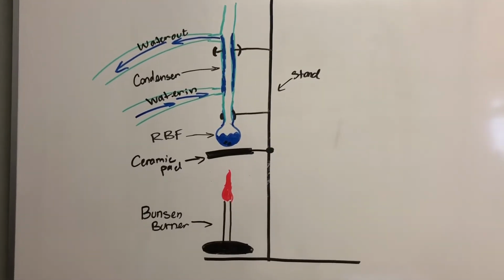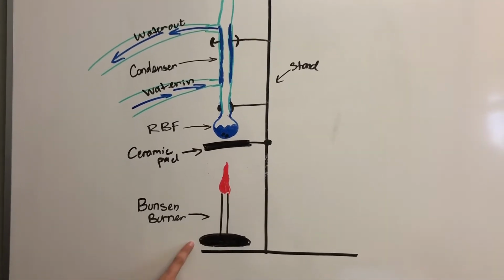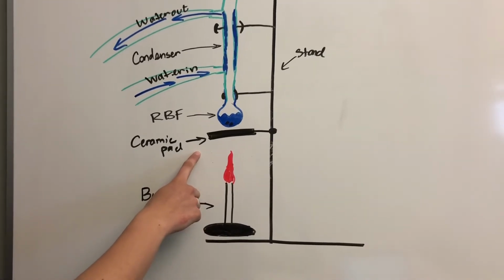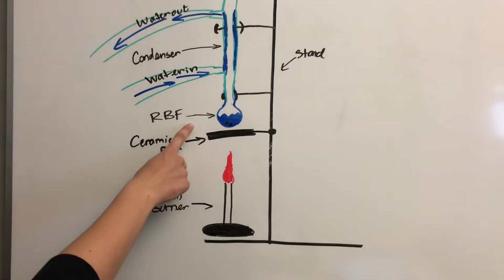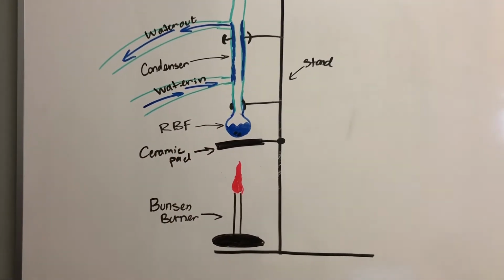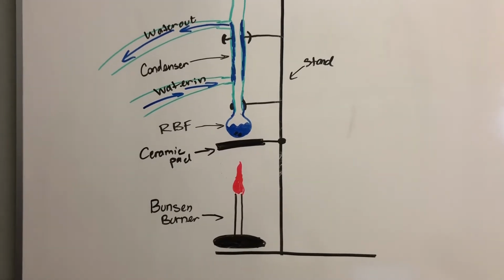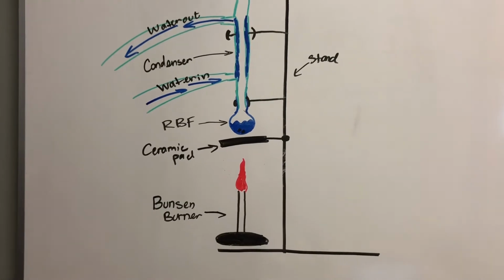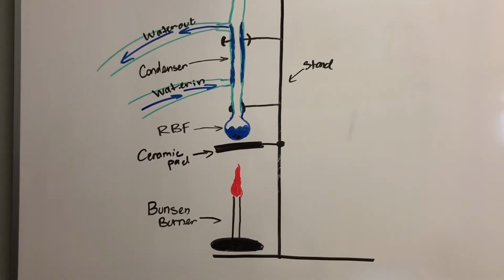The materials for this experiment are a Bunsen burner with a ceramic pad just placed about 2 inches above it, as well as a round bottom flask which can be 50 or 100 milliliters. And inside this flask we have the reagent mixture with a couple boiling chips. The flask is slightly above the pad, held by a snug clamp.